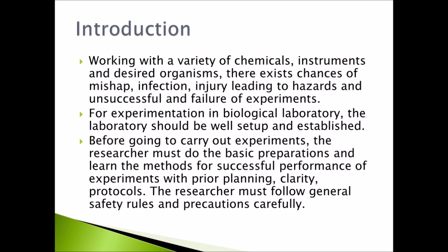And before carrying out experiments, the researcher must do the basic preparations and learn the methods for successful performance of experiments with prior planning, clarity, approach, and protocols. The researcher must follow general safety rules and precautions carefully.